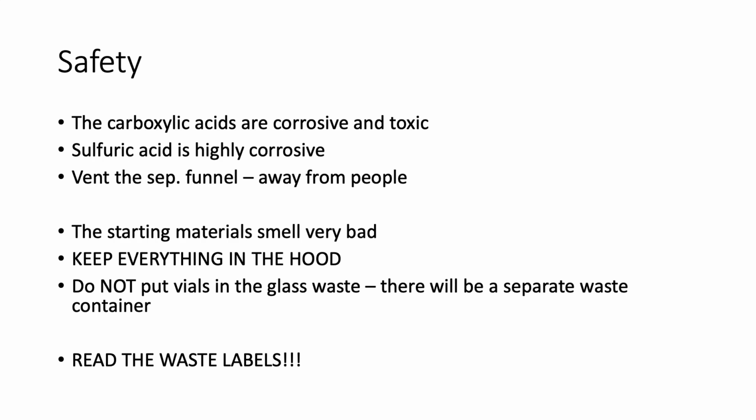Sulfuric acid is also highly corrosive, so you don't want to get that on your hands. And then you want to vent the sep funnel, like we said, away from people. So if you're working in a hood with someone, make sure that they're not around. Don't turn around to talk to somebody and point it in their face.